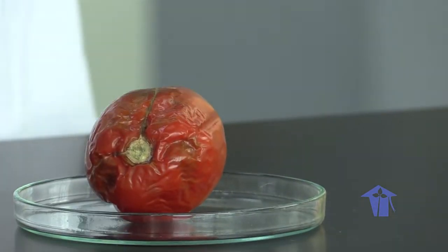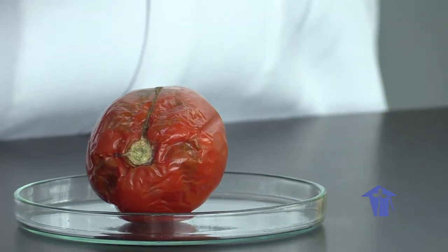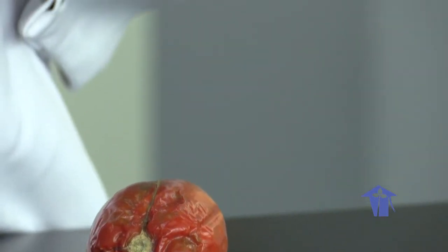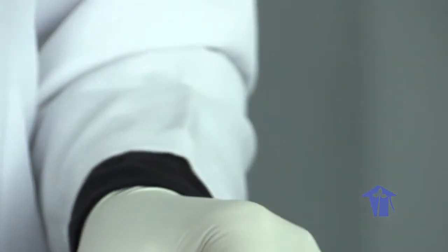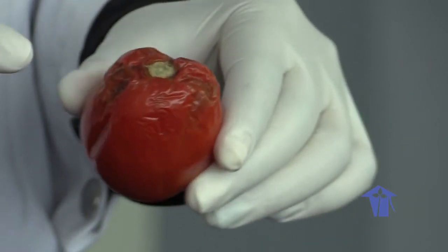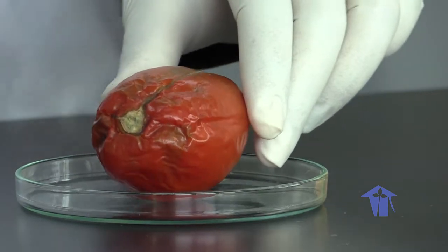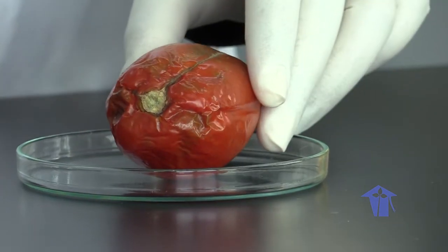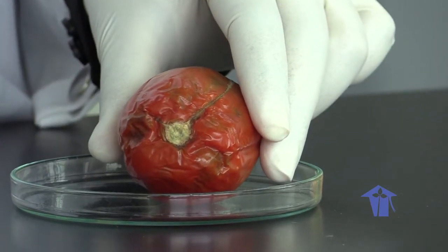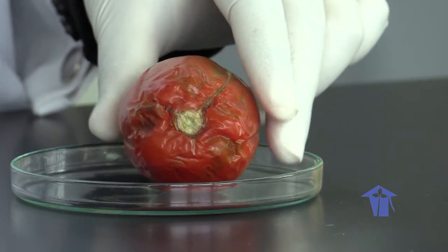Following aseptic techniques, the entire environment has already been swabbed, wiped down, and cleaned with 70% alcohol. We have our inoculating loop here, which we will be using to transfer a sample of the bacterial or fungal organism. We do not know its identity, but it will be used to transfer a sample of the organism onto a microscope slide. A Gram stain will be performed on this sample, and the morphology of this sample will be recorded, as well as a quadrant streak done in order for us to obtain a pure culture for our next session.